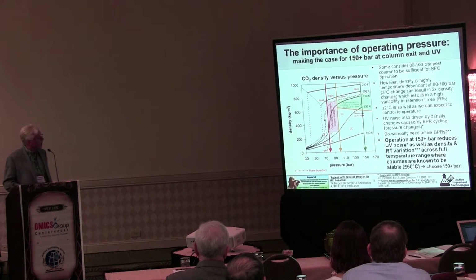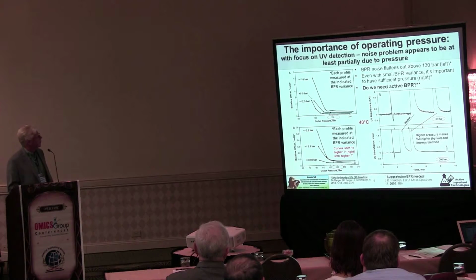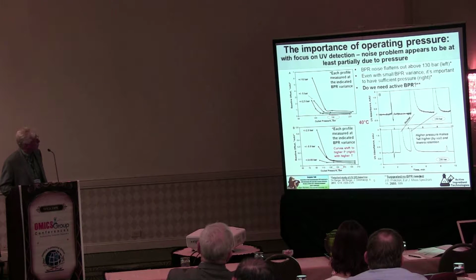And as a result of that, it's important to start out with operating at the proper pressure. And we would argue that this is out here where these density lines start flattening out, not here where they're almost vertical. And bottom line, we would say that's 150 bar at the column exit. So this has been studied. Terry Berger studied this a lot and studied the effect of the back pressure regulator too. But you can see noise is higher until you get up to some reasonable pressure. And this is the data that really leads us to believe that a minimum of 150 bar is the right pressure.